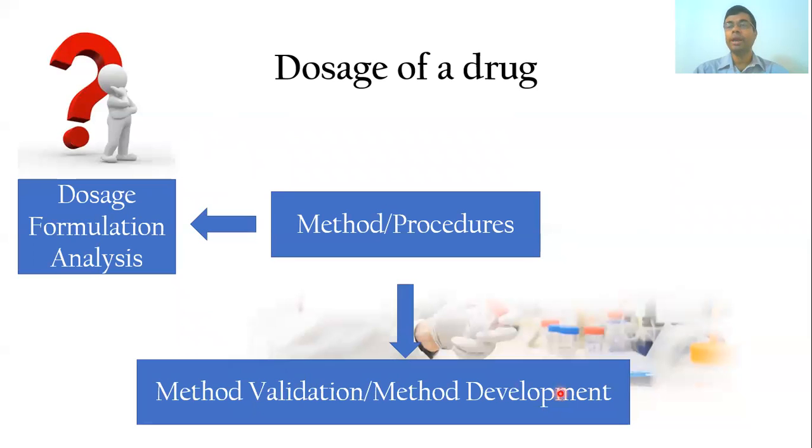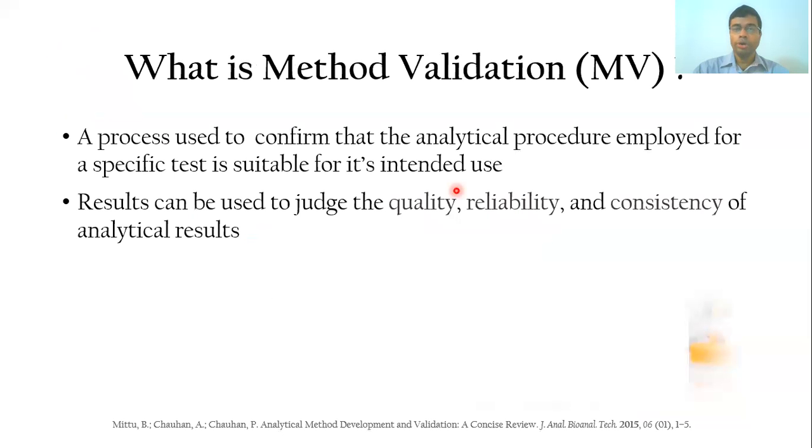That is not practical because we need to do a lot of studies beforehand, prior to coming to the last step, which is called the dose formulation analysis. Not only that, this method validation or method development is under the surveillance of certain different organizations. Before we look into that, let's quickly look at the meaning of method validation.